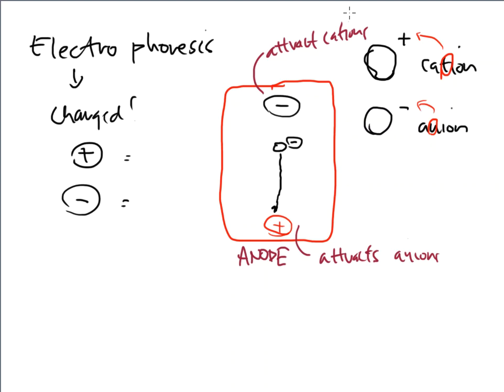Free pizza, free beer. Woohoo! Party's on us. And those cations begin to migrate and they begin to move. So up they go. If they were positive, up they go, right? All right, so because they are attracting cations, we are going to call this a cathode.